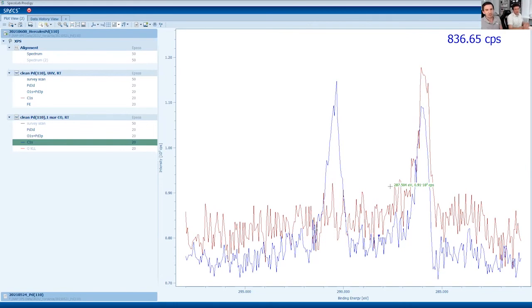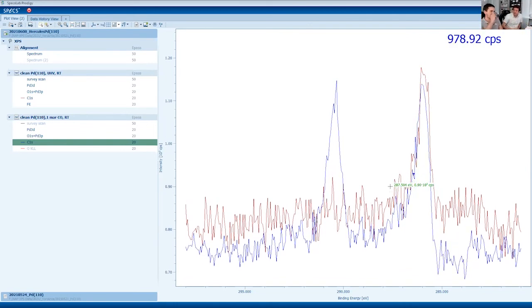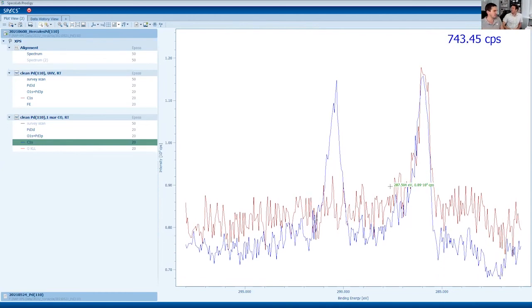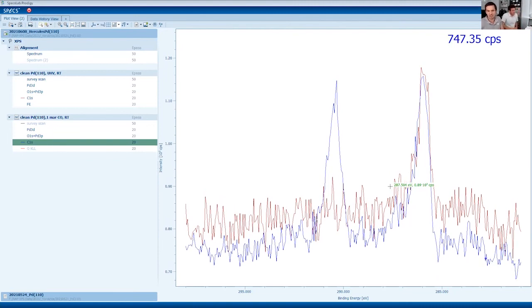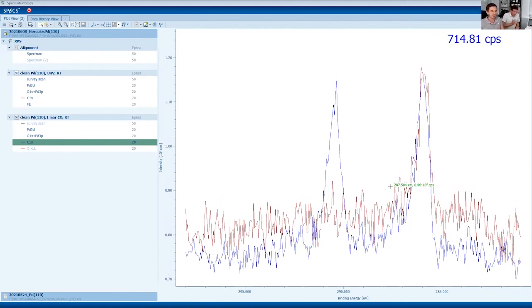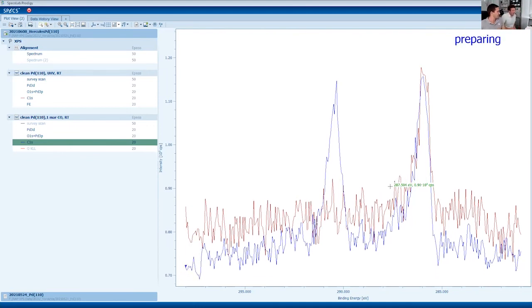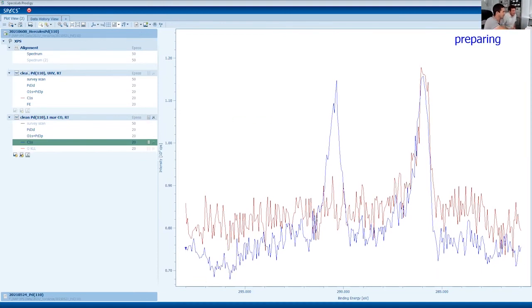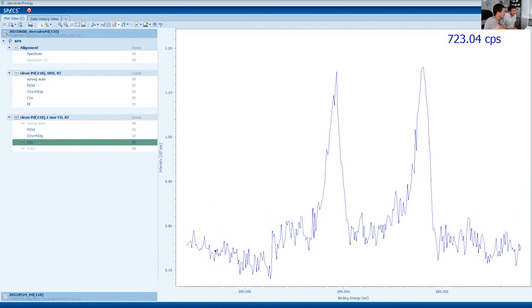Let's do it. I will open the oxygen and put in a little bit. But then maybe we need to heat it, maybe a little bit too high. I don't know if it happens at room temperature. We can work another half an hour; we still have until 5:30 sharp, if no one else is interested. However, we can just try to put in the CO and try CO oxidation. You would see if we get some product at room temperature. I'm not sure about that. However, we can simply start heating up the sample.